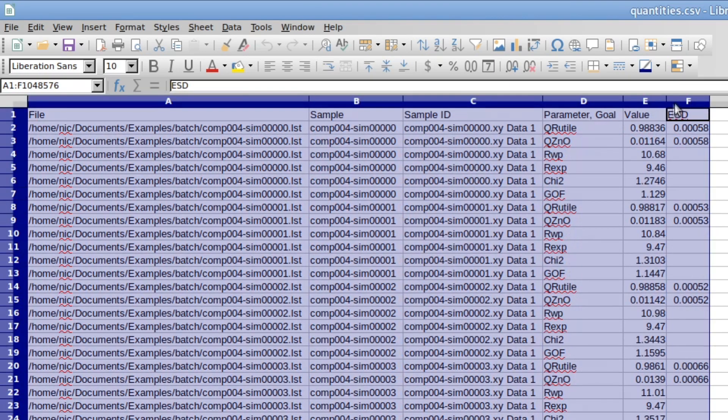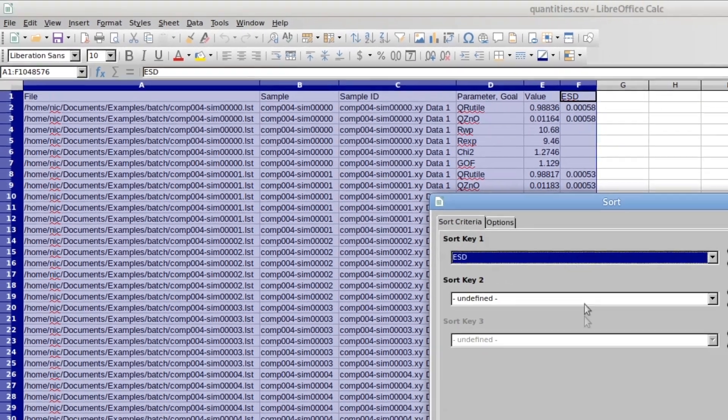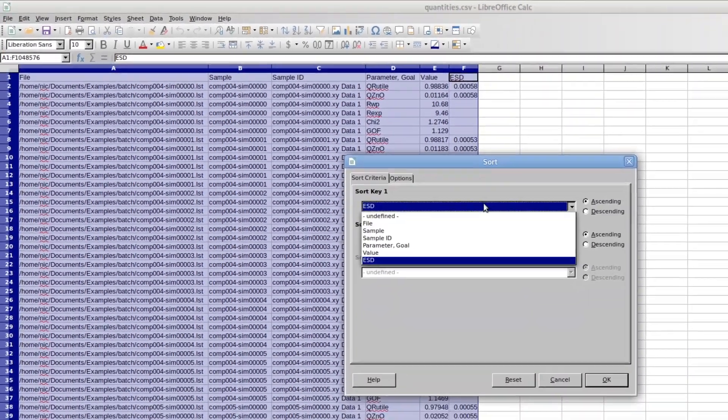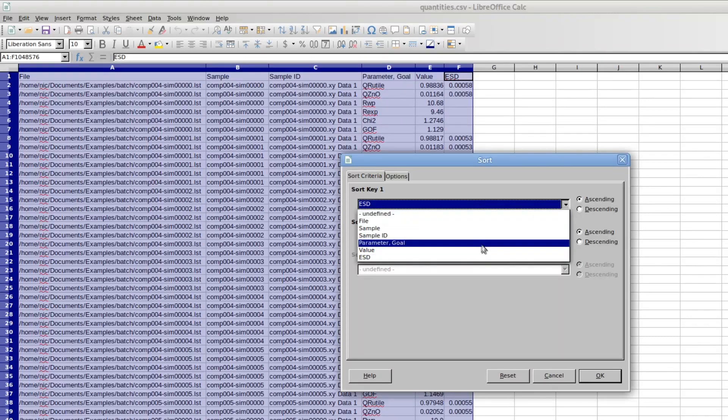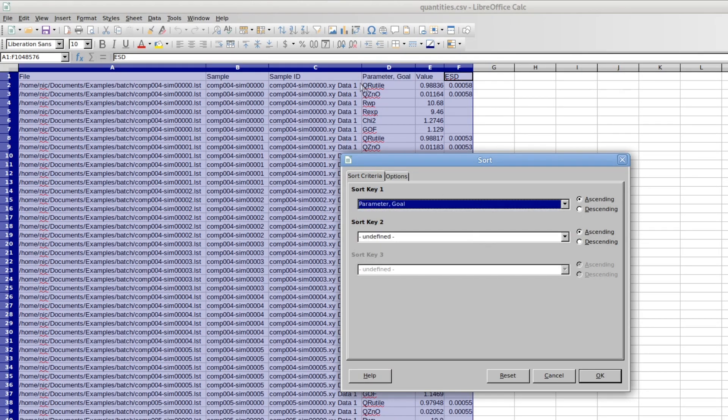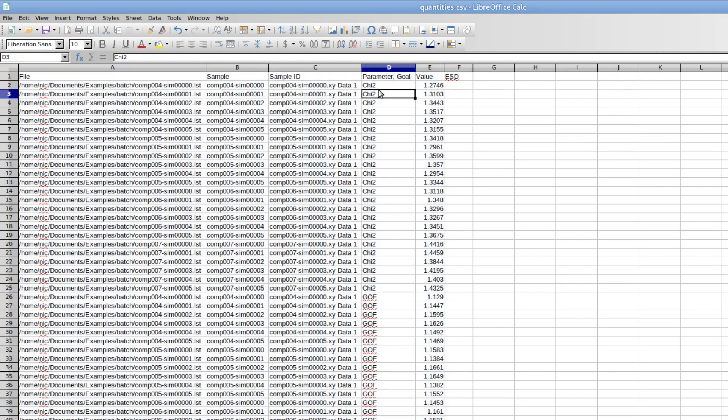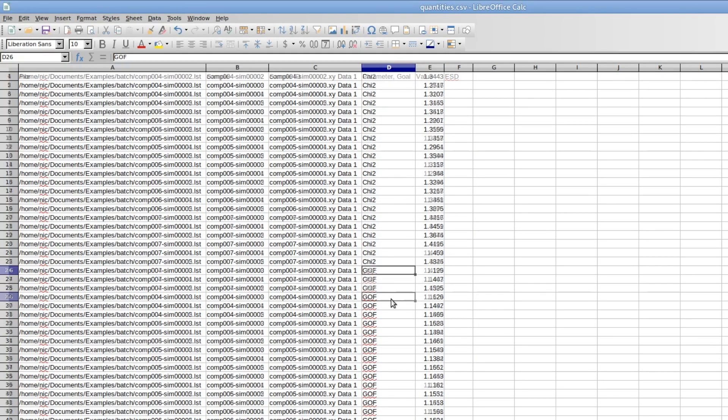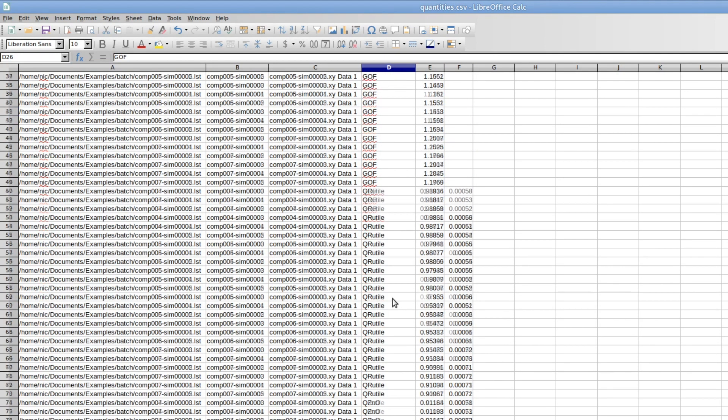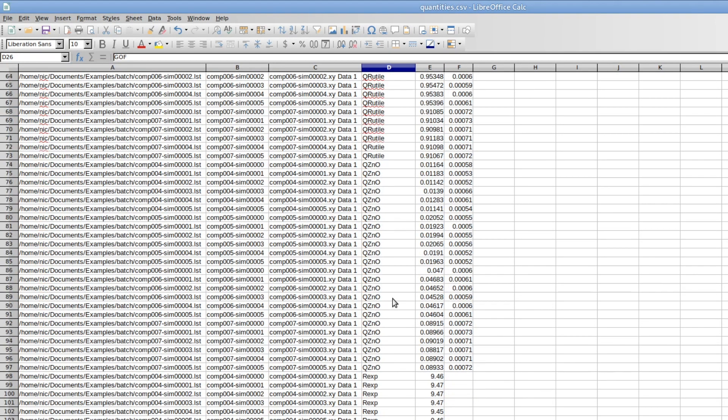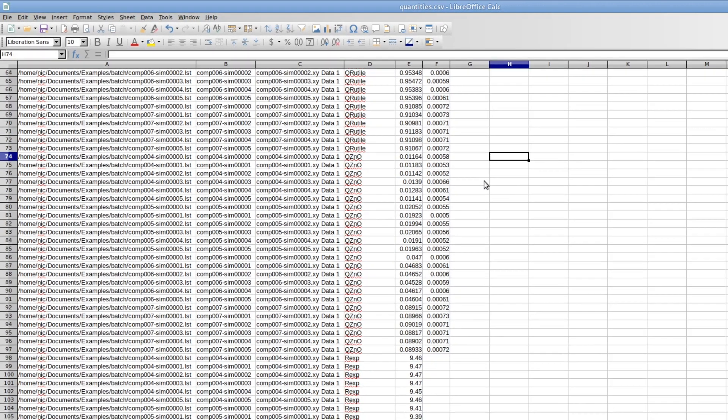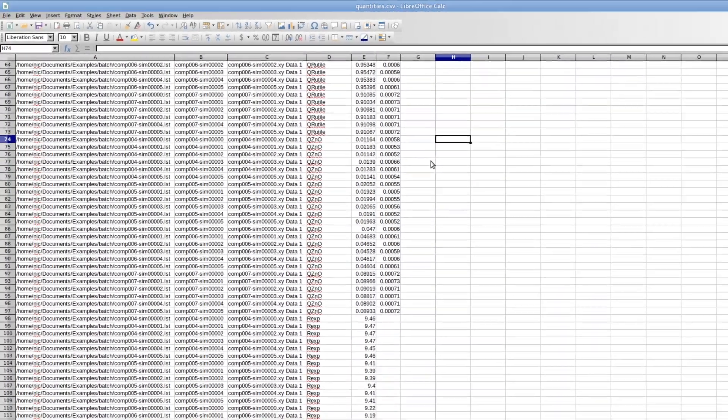So it's easier if I sort everything by parameter goal. So by this column d and now I have all chi-square, all goodness of fit values first and down here all quantities of the data sets of zincite.